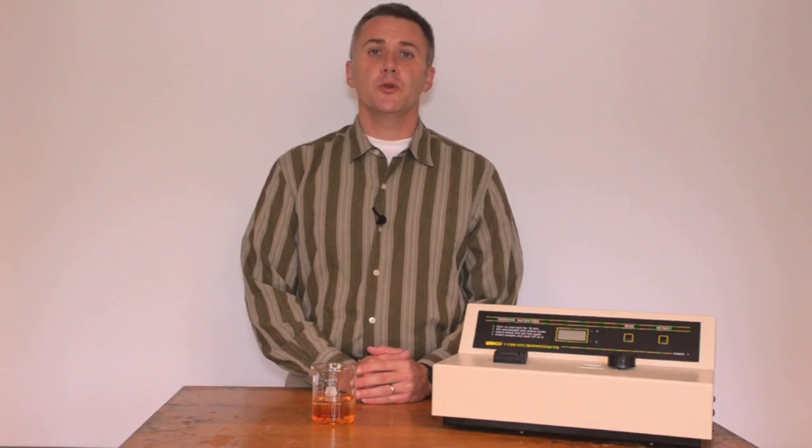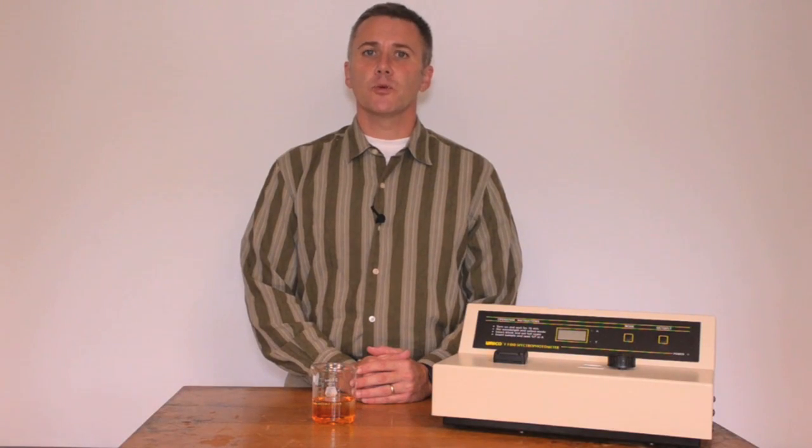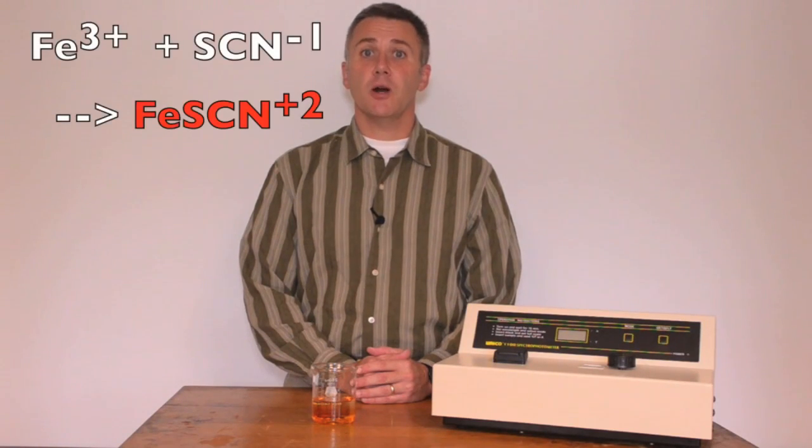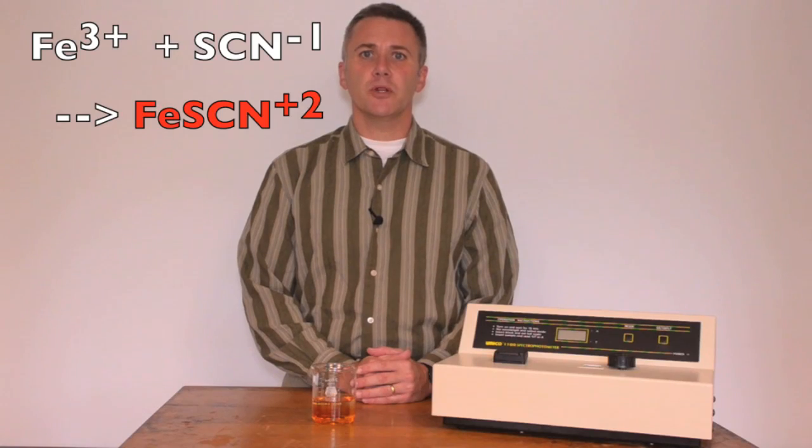The aim of this experiment is to empirically measure the Kc for the reaction of iron with a thiocyanate ion to form the intensely colored complex of monothiocyanate iron. The reaction is shown here for your benefit.